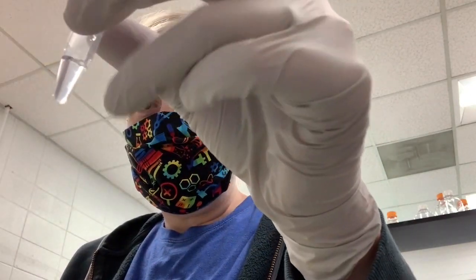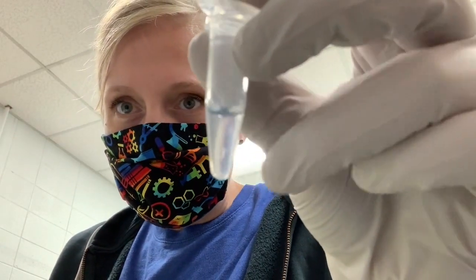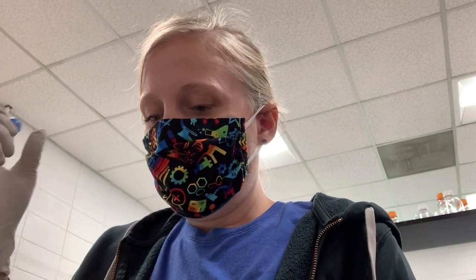Sometimes you'll see a little bit of swirliness after you add the ammonium acetate. It's a little bit swirly. And you may notice that as well when you add the ethanol. And that's the nucleic acid precipitating.